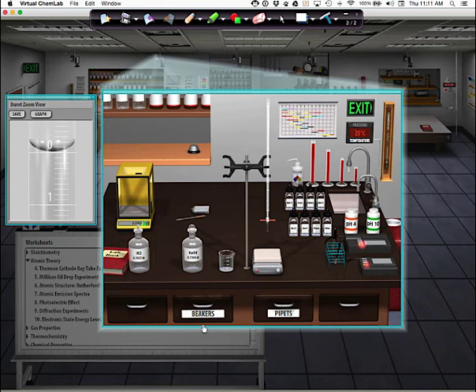All right, okay? And then, guys, now we've got our beaker. That was step 11. Now, guys, step 12, this is tricky. Step 12 says, fill the 10 milliliter graduated cylinder with the acid and record the volume. Now, guys, these are your graduated cylinders, but they are magic graduated cylinders.